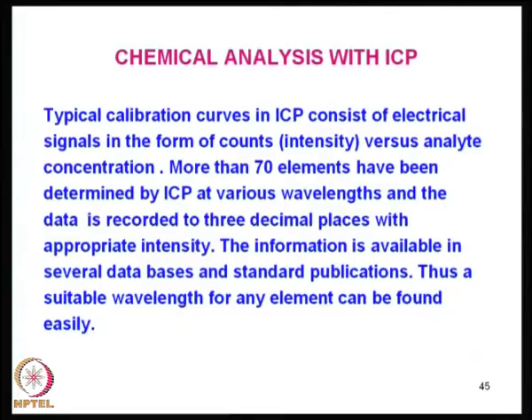one has to appreciate that it is just the number of counts you are counting and plotting. It has nothing to do with the element. The calibration is always relative with respect to the counts only. So, whether you want to determine cadmium or copper, it is always the counts. So, the counts have nothing to do with the element.